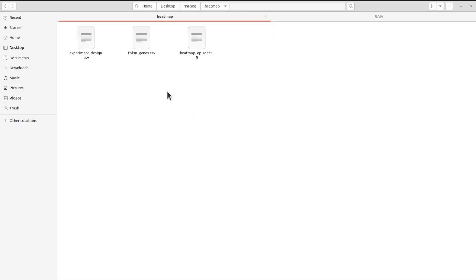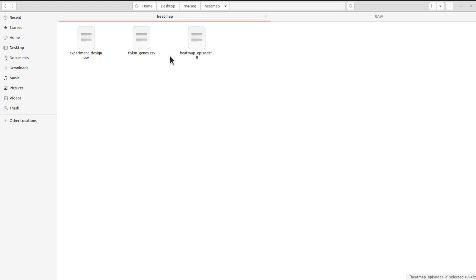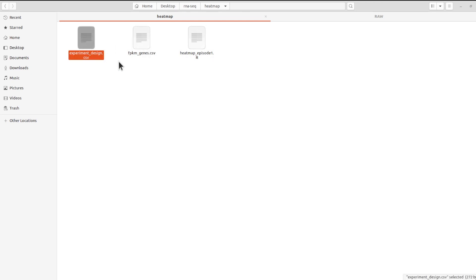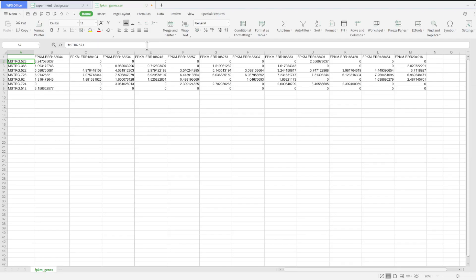I have the materials here: the R script, the data file called fpkm_genes, and another file called experiment_design. Let's open the fpkm_genes file first.